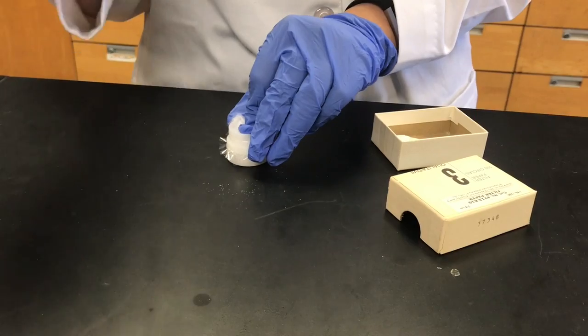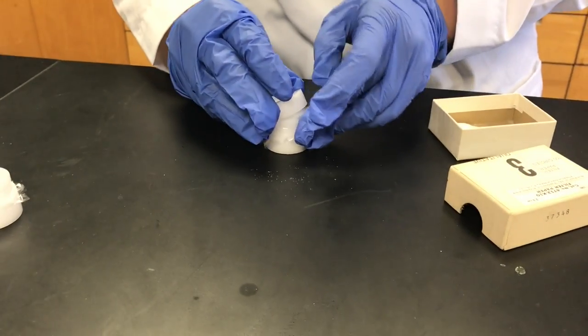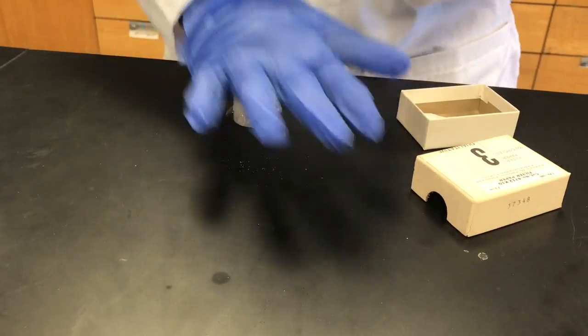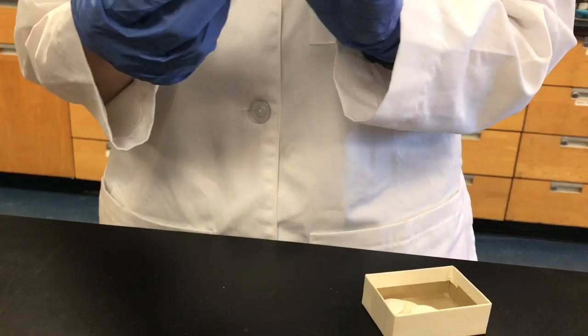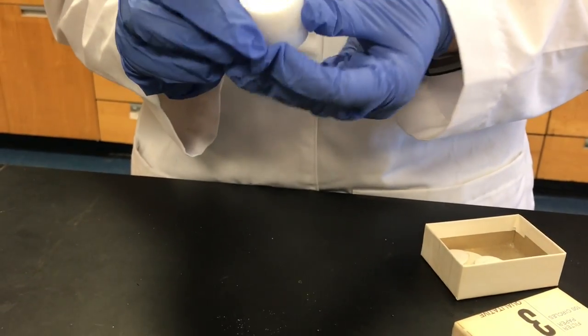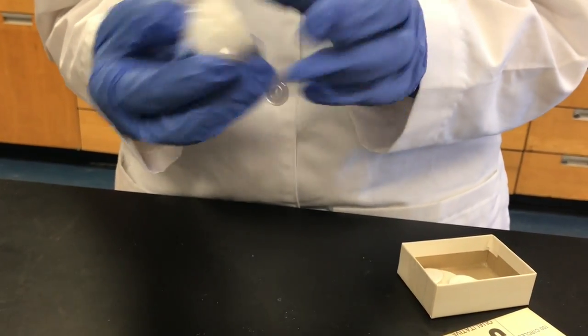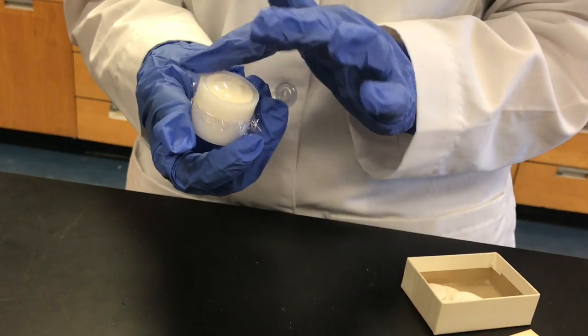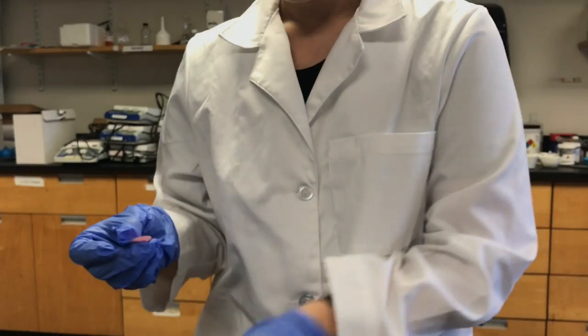Okay, and now we're going to put this closed top on. So this is the side that your sample's on, and then this is the closed side. But when you put it in the machine, you're going to want to put it with the sample side down.